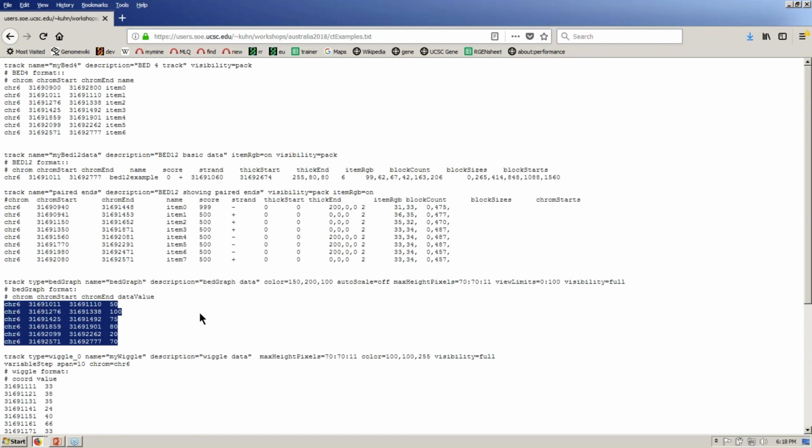I'm sorry, what kind of data? I think Lou's cueing me over here. So what kind of data might you want to put in this?